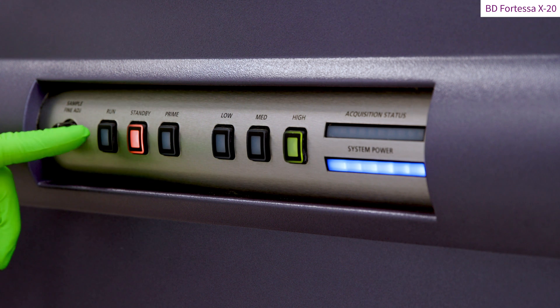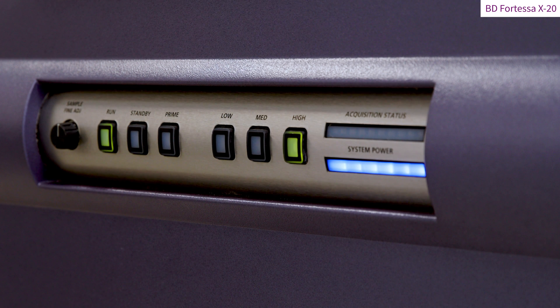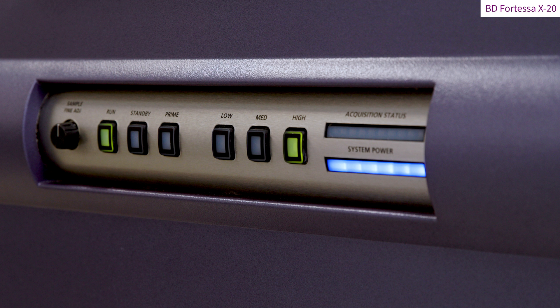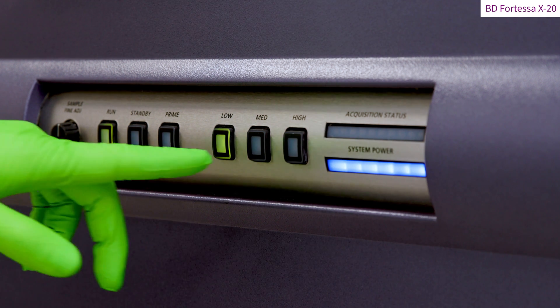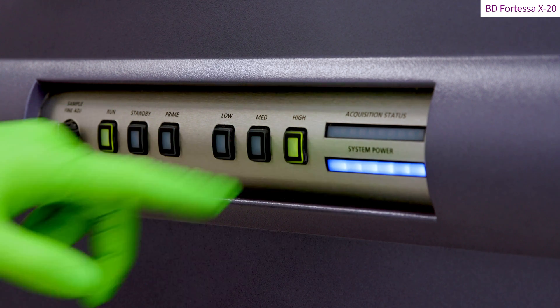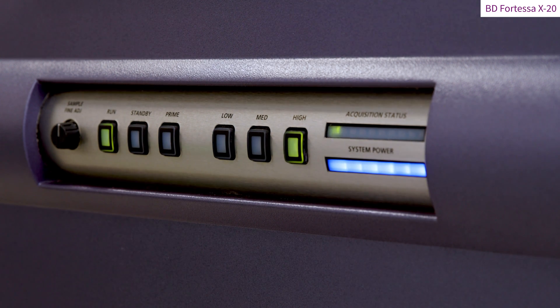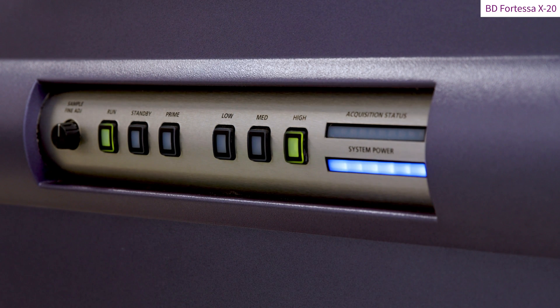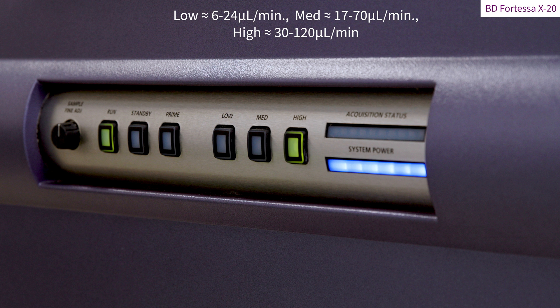The run button allows you to acquire cell suspension or cleaning solutions through the sample injection port. The acquisition can be performed at three different speed levels: low, medium and high. The ranges of volumes acquired per minute for these three speeds are 6 to 24 microliters per minute in low, 17 to 70 microliters per minute in medium and 30 to 120 microliters per minute in high.